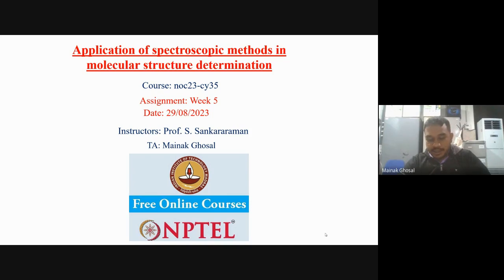Today's session is going to be a little more informative, and you need to find this structural information from your mass data also. You will be given your 1H NMR, your 13C NMR data and mass data, and from them you need to find which molecular structure corresponds to this data.